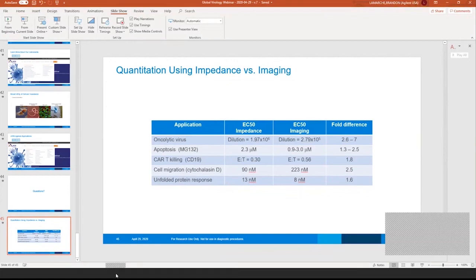The final question is, Brandon, what causes the spikes in impedance that are commonly seen at the time when the experiment is paused or when the virus is added to the plate? Is it a function of media, temperature? If you can comment on that, that would be good.